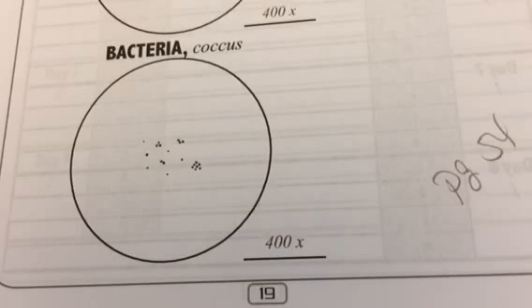So for homework, please do not forget to start the bacteria part 2 lab by preparing your petri dish tonight, or your culture dish, so that you're ready to swab your teeth tomorrow morning to get the bacteria off before you brush, after you brush, and after you use the mouthwash. And then starting Tuesday, you're going to want to go to page 59, table 12.1, to start putting in your results.